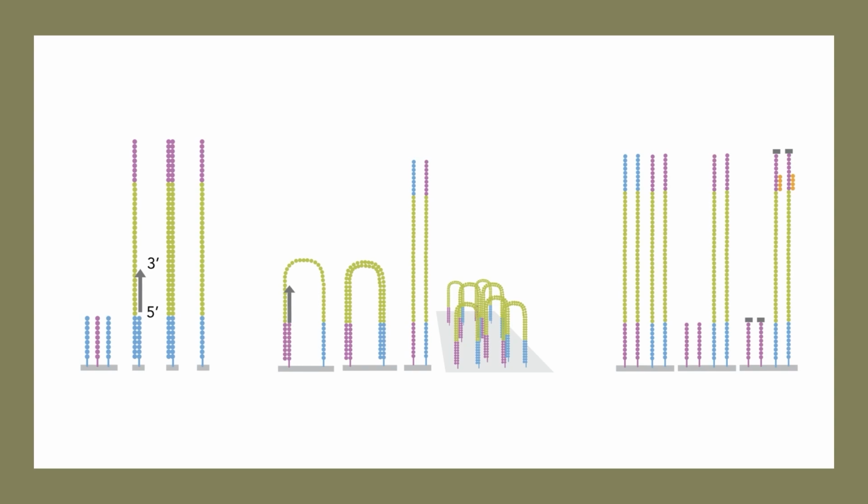But first, I have to go into sequencing chemistry a bit. This is another place where it is important to understand something about the chemistry that generated the data you are viewing. Alignment interpretation may change a bit with a different chemistry, but even if you are using a different chemistry, hopefully this segment will at least demonstrate how to think about chemistry in the context of DNA alignments.